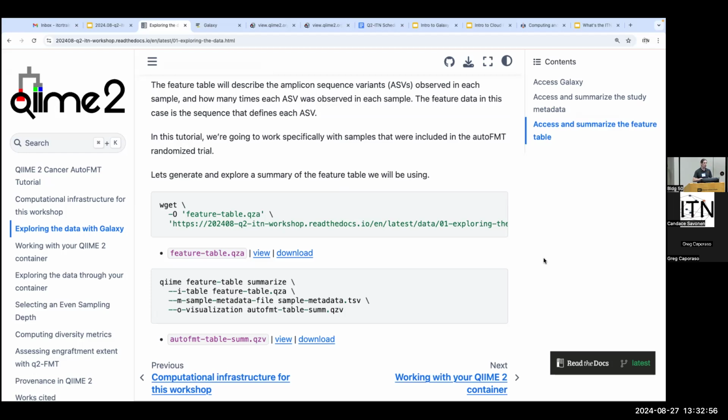We have all of that covered very extensively in our documentation. So rather than spend time on that in this workshop, we're going to focus on the aspects of the analysis where we get to poke around with some of the interactive visualizations. But we're more than happy to answer questions on those upstream steps, really anything you're wondering with respect to QIIME.